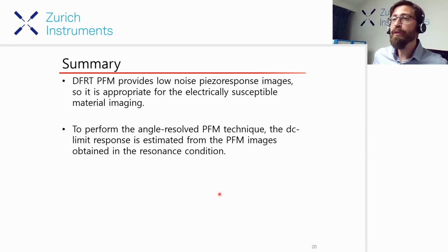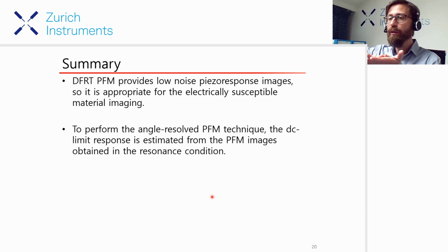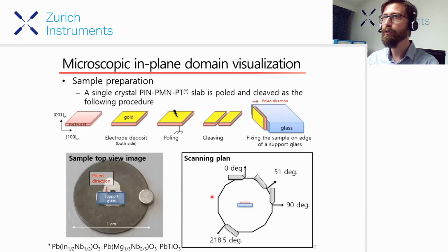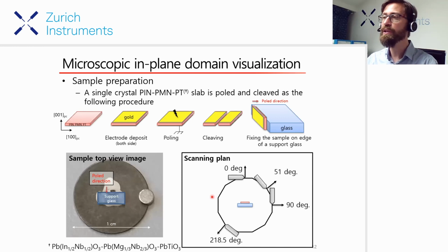Thank you very much. So that's a challenging technique. Let me ask you a first question. You have to rotate not only at 0 and 90 degrees, but at different values for this lateral PFM. And don't you see the effect of drift or creep when you have to change? Because how long does it take to make all these images so that you can reconstruct everything?